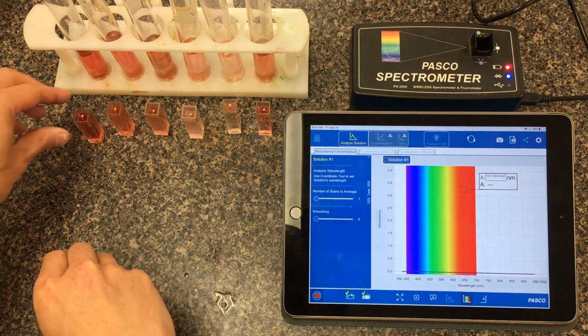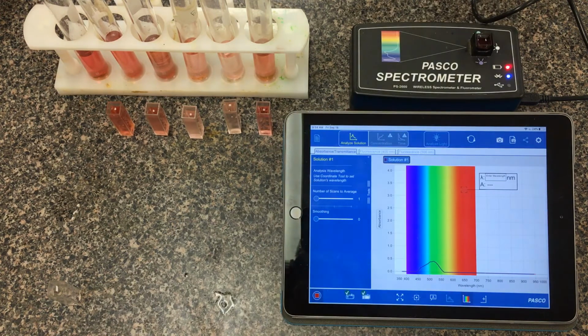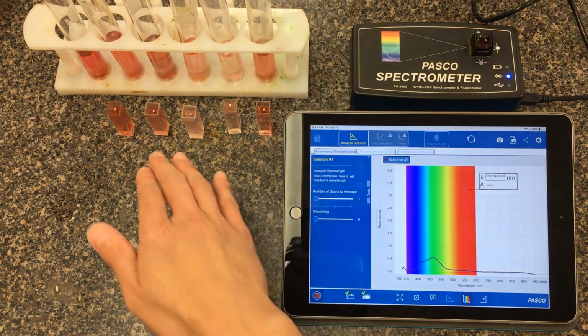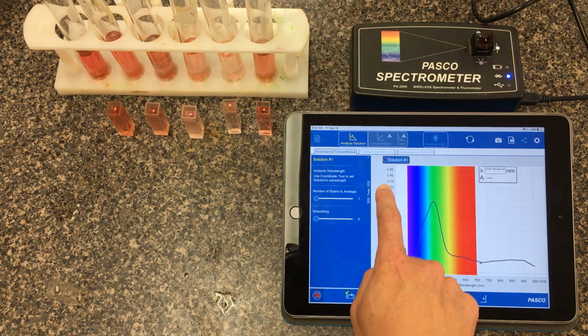We're going to start off with our most concentrated sample here. This one here was supposed to be a rough 0.160 molar, so you stick that in first. First chart we get here is an absorbance versus wavelength graph here. We want to figure out what lambda max is, which wavelength of sending in is giving us our strongest signal, so that later on when I check the other dilutions here, we'll try to maximize the numbers and therefore minimize errors. Remember, our chemicals look red to us not because it's absorbing red. We see on the spectrometer here, it's actually absorbing the complement of red, which is somewhere in the green region here.